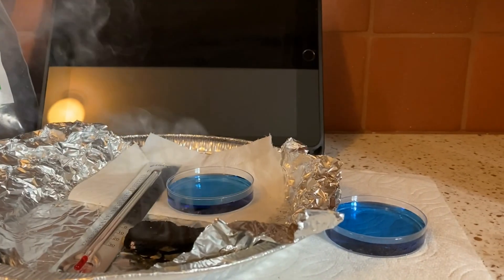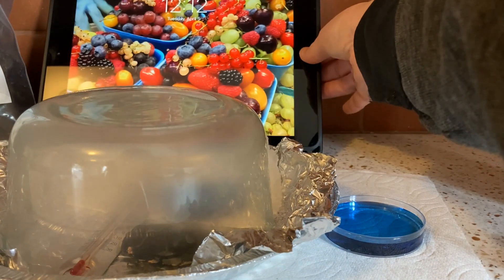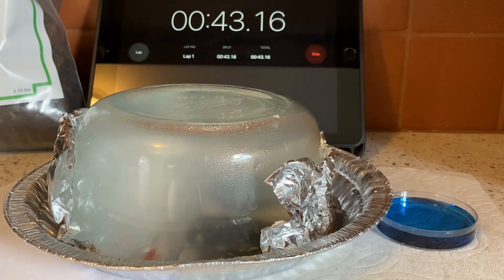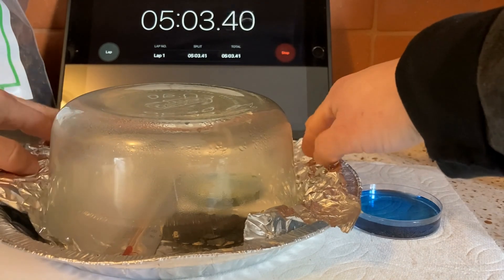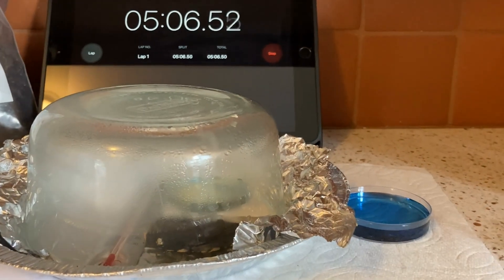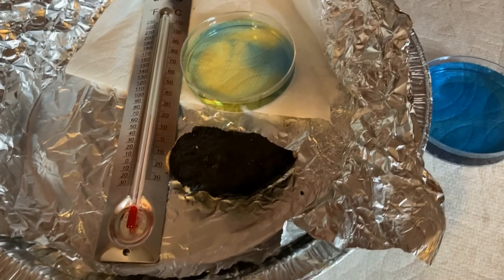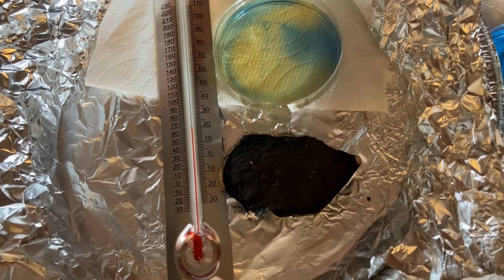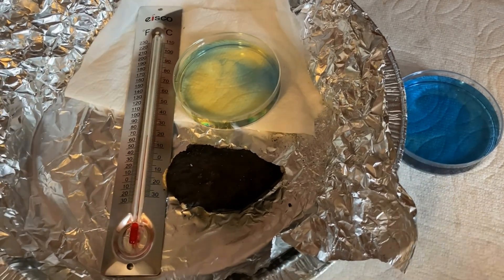I'm going to move this into our setup, put the lid on where we had the blue bromothymol blue, and start the timer. It's been five minutes, so let's look inside and check the color — and definitely a difference in temperature there.